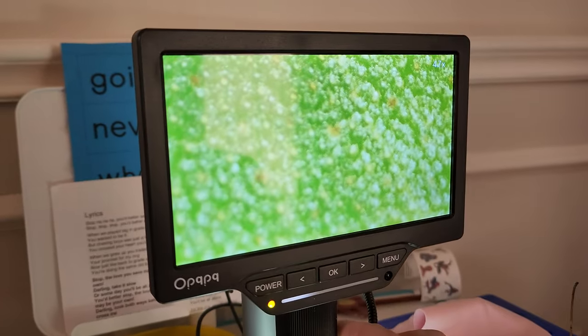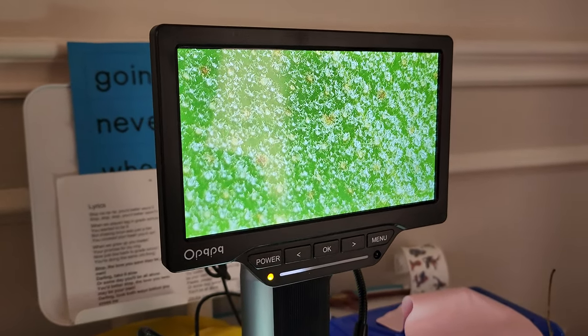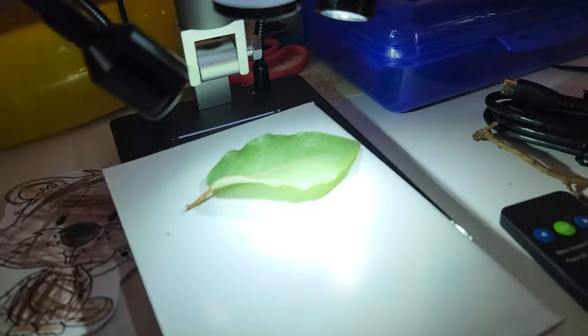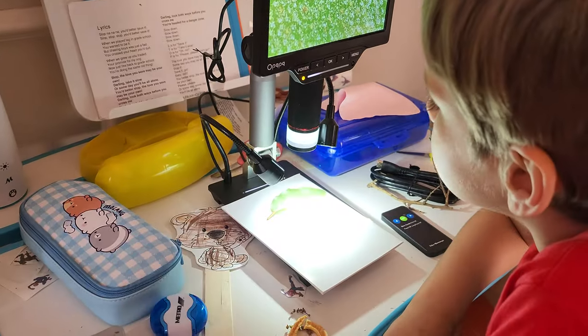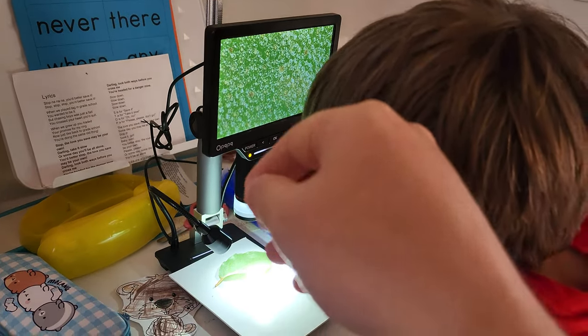So let's touch the focus just a little bit. Did you see that? That is beautiful. And that is the leaf right there. Obviously I've got a little bit of flare because I've got a lot of light on it, but when you zoom in you have to have more and more light for the zoom.